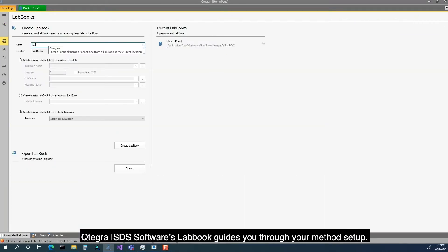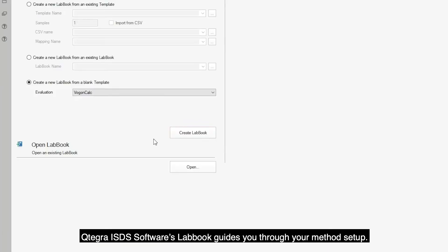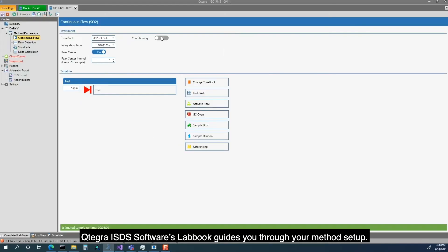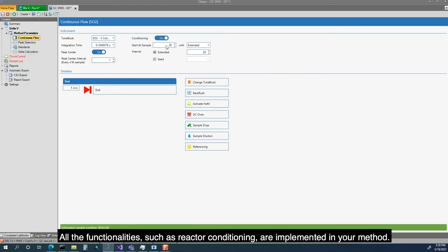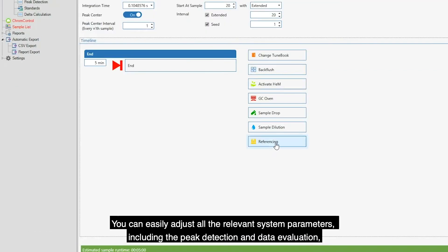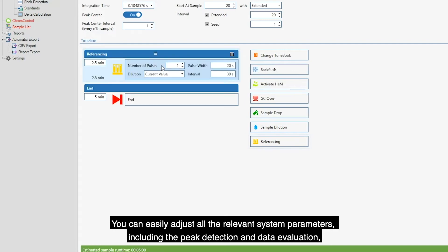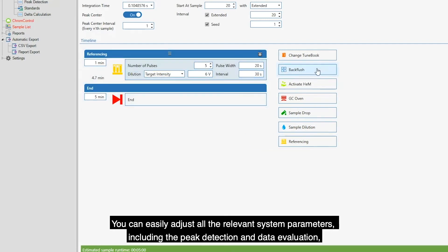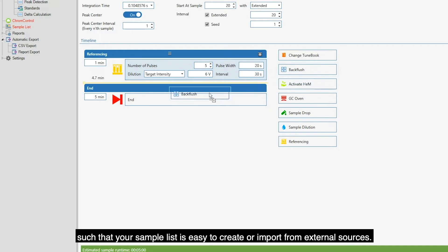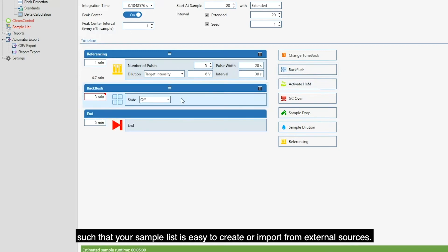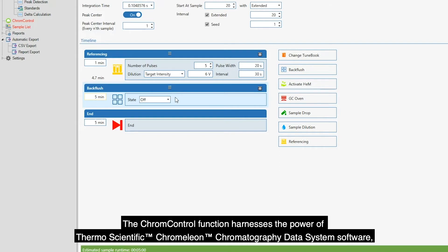Cutegra ISDS Software's lab book guides you through your method setup. All the functionalities, such as reactor conditioning, are implemented in your method. You can easily adjust all the relevant system parameters, including the peak detection and data evaluation such that your sample list is easy to create or import from external sources.